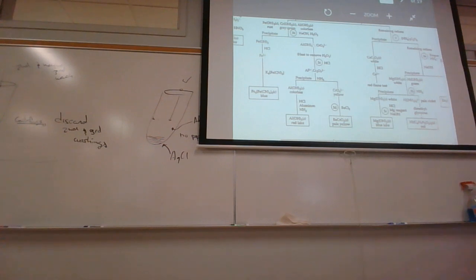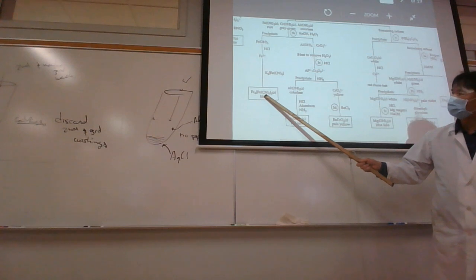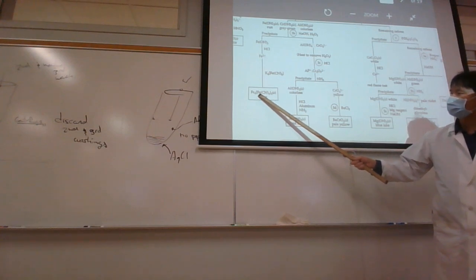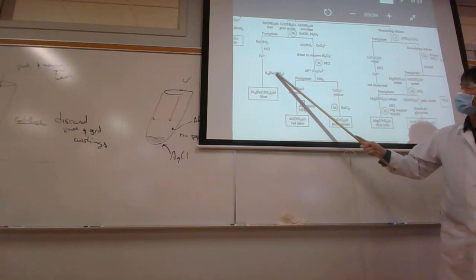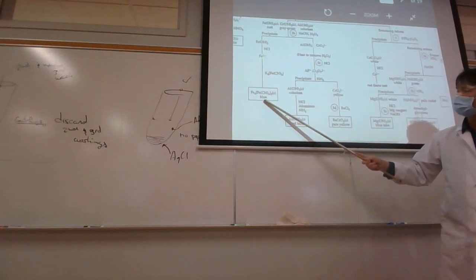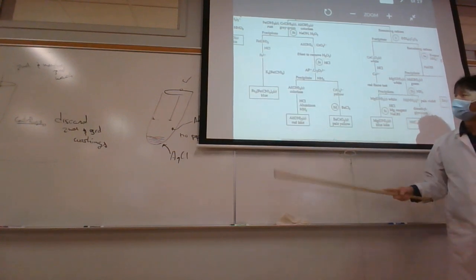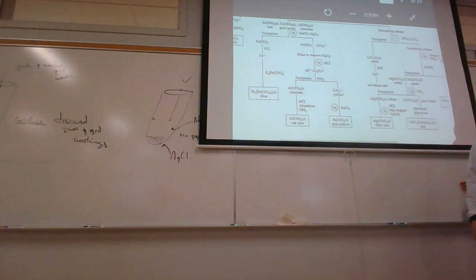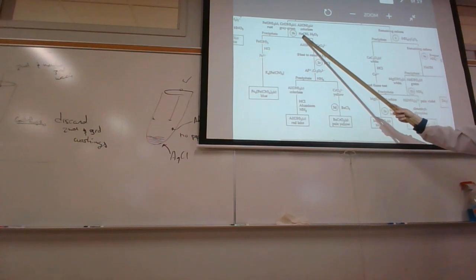The new precipitating agent would be this. This is going to be the hexacyanoferrate ion, ferrate 2. And the hexacyanoferrate 2 is going to precipitate this and make a blue precipitate here. This blue precipitate is a very famous one. You'll probably take a look at the color of that and see what it looks like.